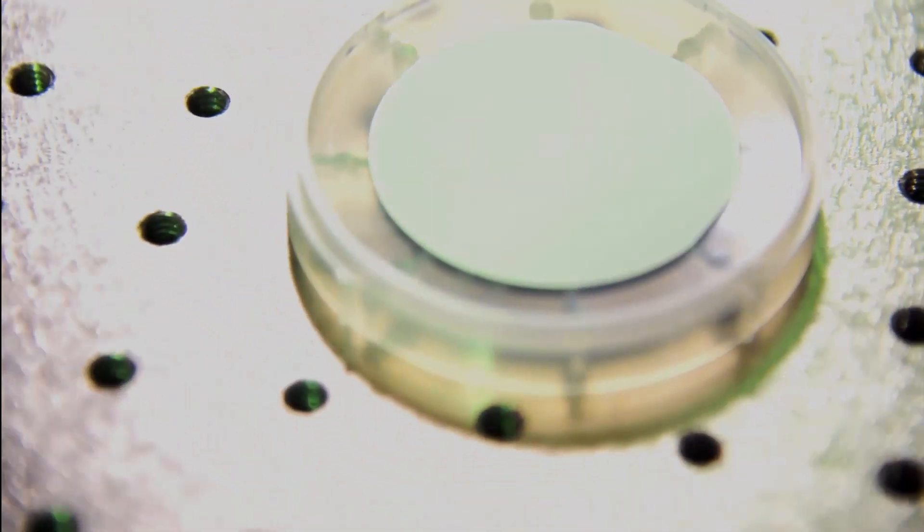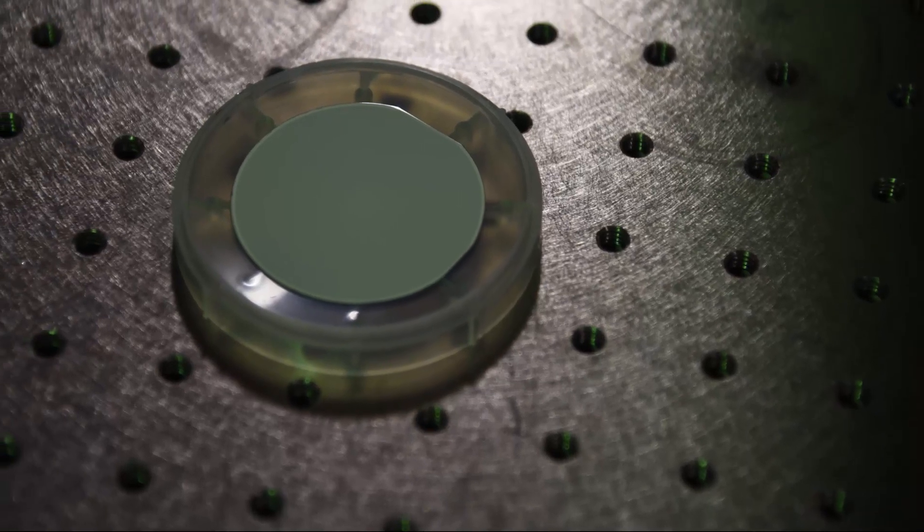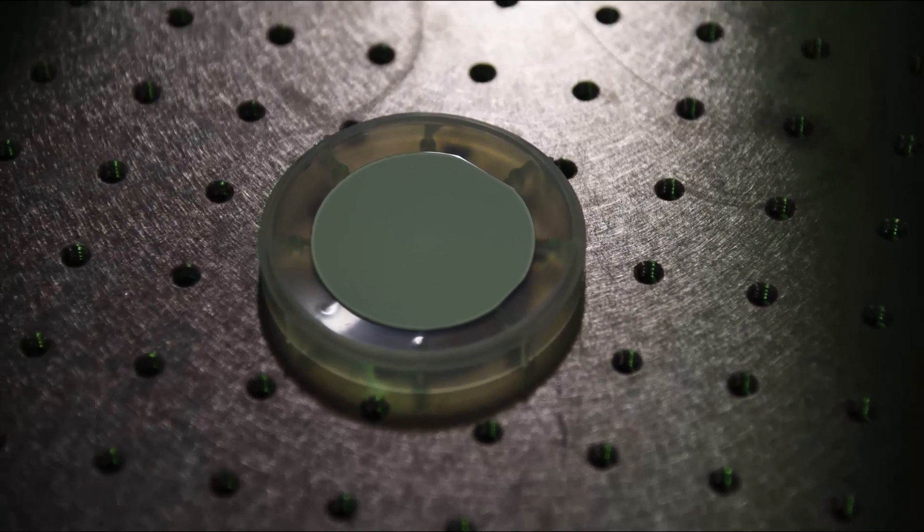Our substrates are silicon wafers coated with the same P43 phosphor used on RHEED screens and sealed with a protective silicate.